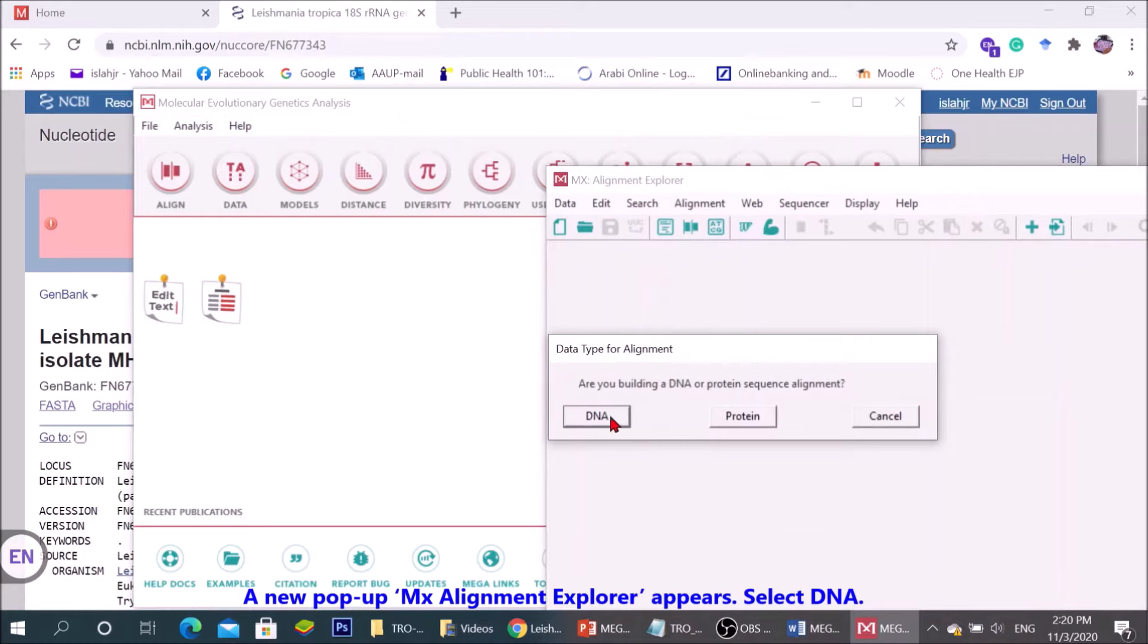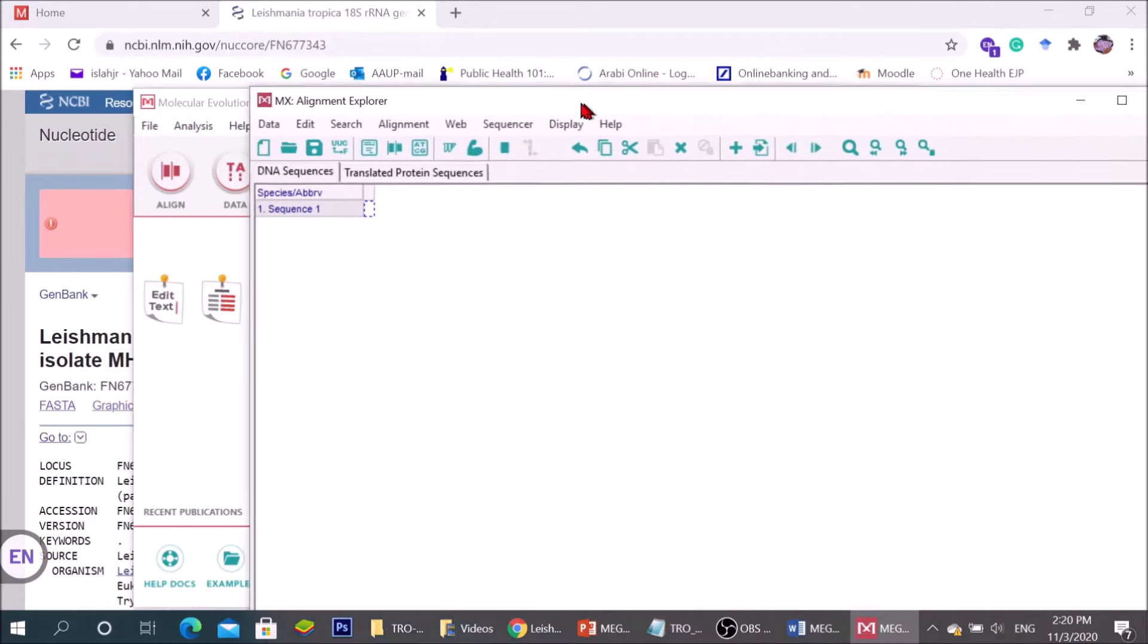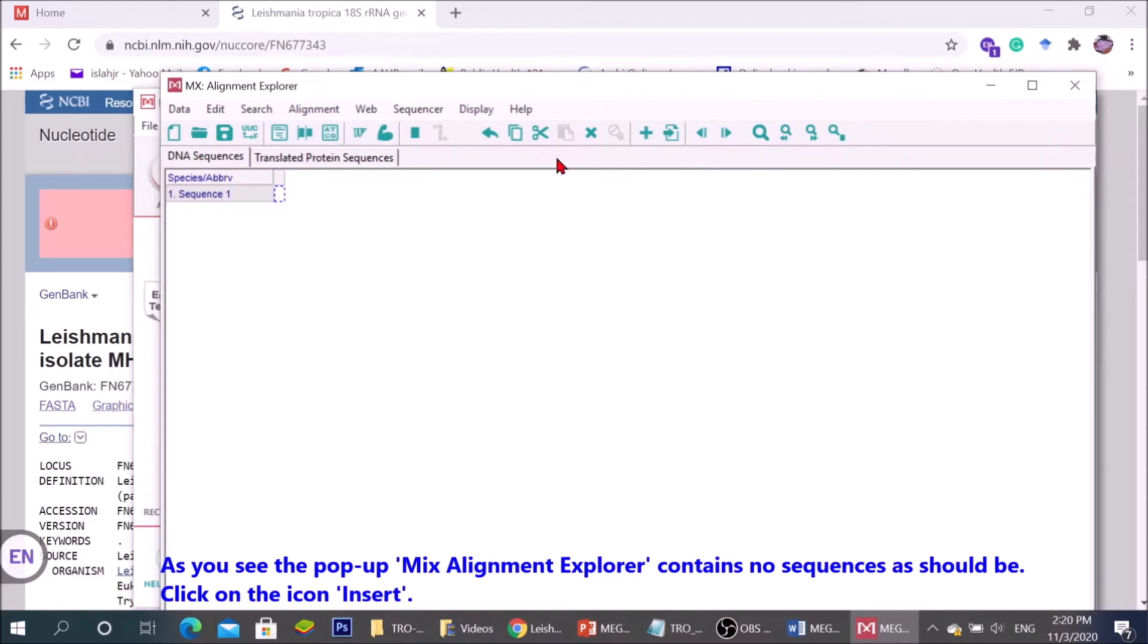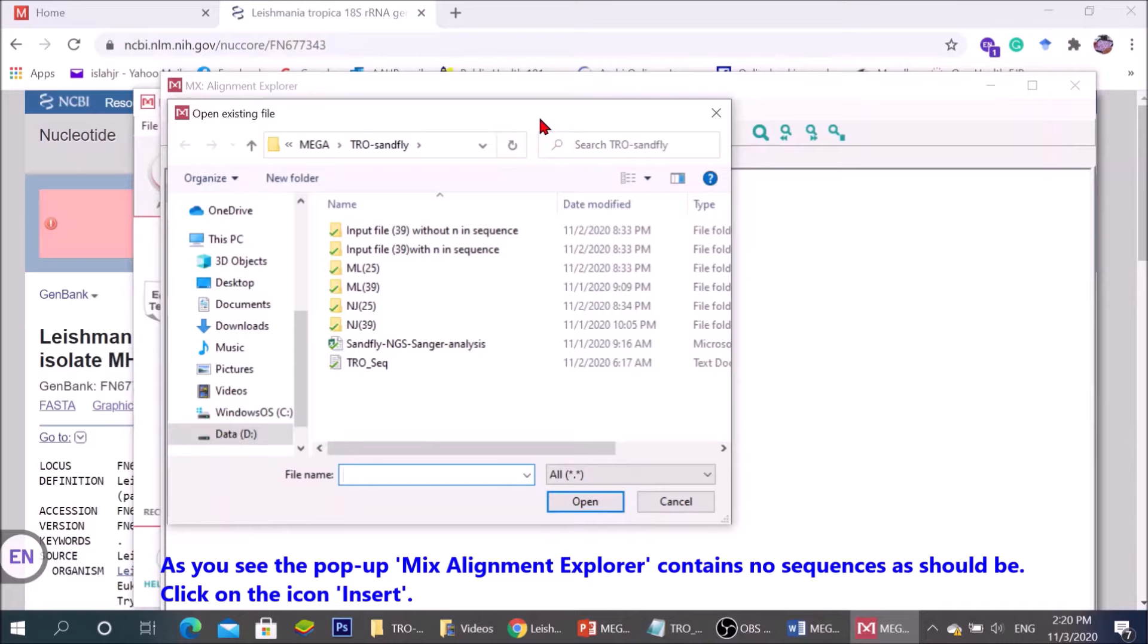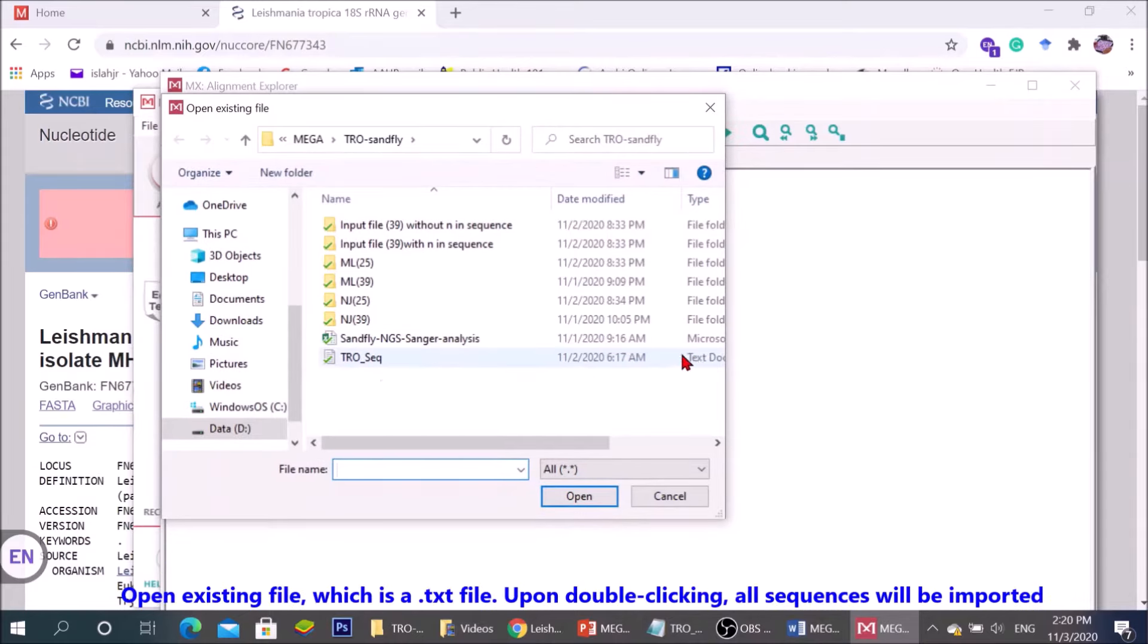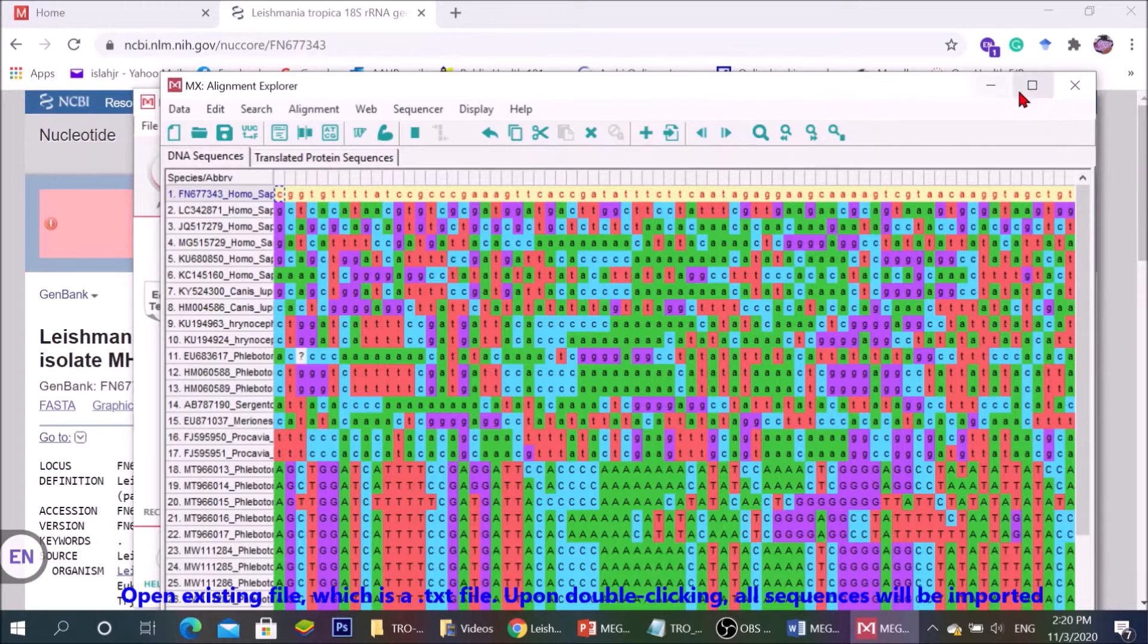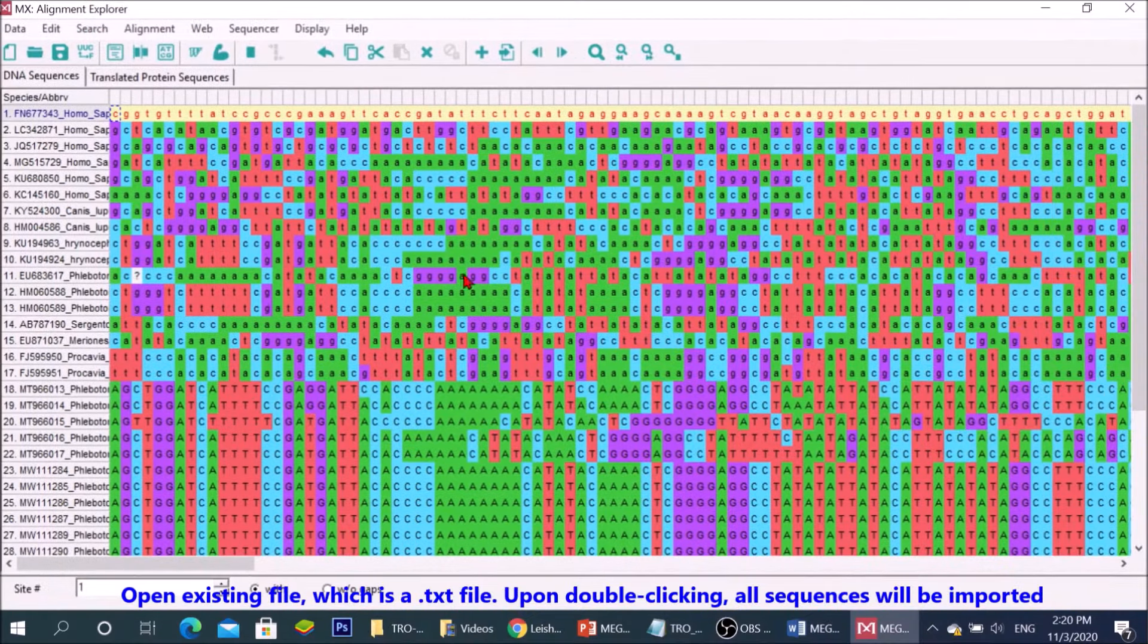A new popup MX Alignment Explorer appears. Select DNA. As you see, the popup MX Alignment Explorer contains no sequences as should be. Click on the icon insert, open existing file, which is a TXT file. Upon clicking, all sequences will be imported.